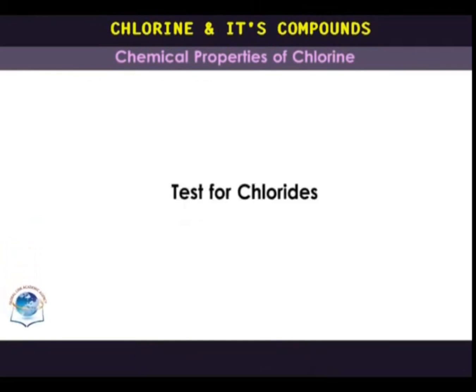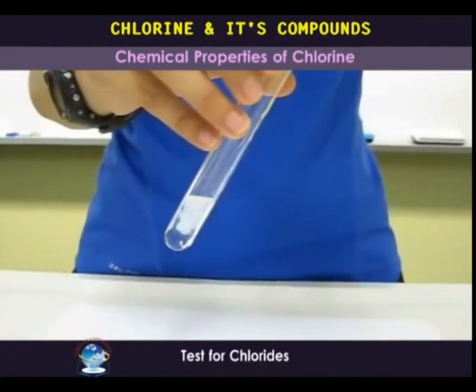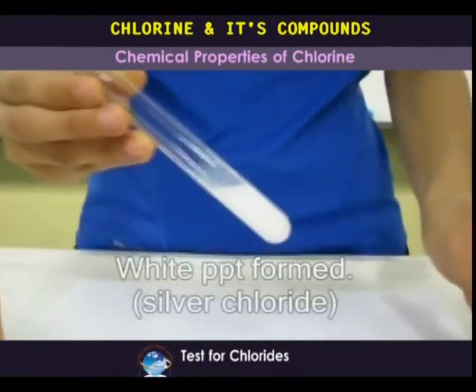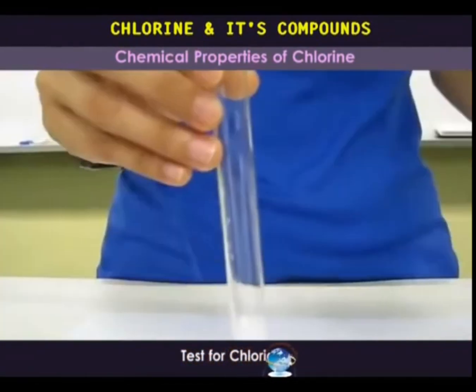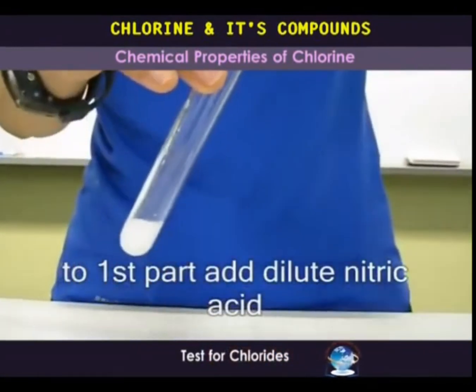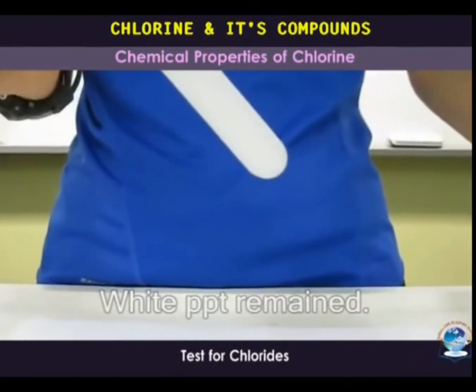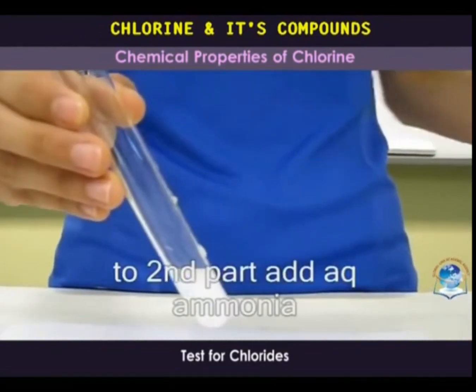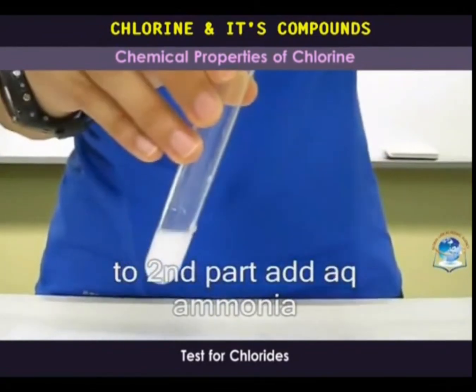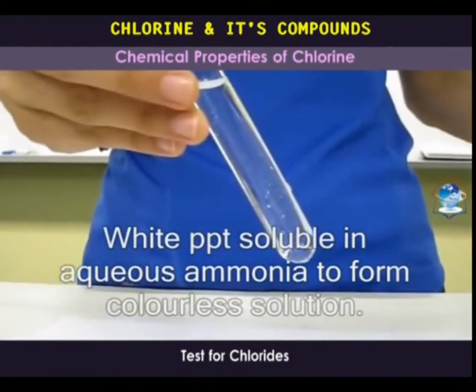Test for chlorides. A white precipitate is formed when silver nitrate solution is mixed with a solution containing chloride ions. This is due to formation of silver chloride, which is insoluble. Dilute nitric acid is added to the test solution so as to react with any carbonate present, forming carbon dioxide. This is necessary because if a carbonate is present, it will also form a white precipitate of insoluble silver carbonate. When excess ammonia solution is added to the precipitate, it dissolves due to formation of a complex but soluble ammonium salt.